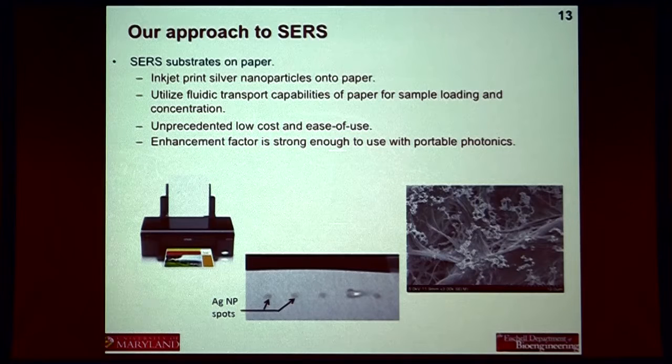So how much control do you have over the geometry? We draw a picture and we print it, honestly. But 3D geometry, not a lot of control because it depends on the cellulose. Okay. And the geometry of, say, this aggregate, and also the minimum feature size, depending on the application? That all comes down to how much you're willing to pay for the printer as well. But there's going to be a limit in the feature size based on the fact that you're printing a wet ink that is going to spread some amount based on what you're printing it on, too. I see.